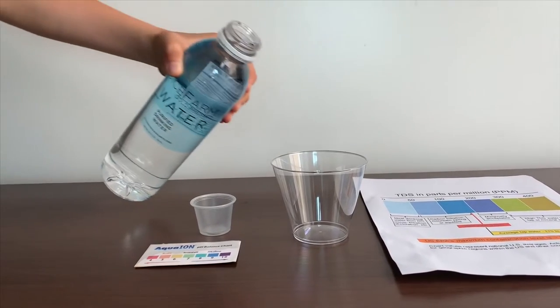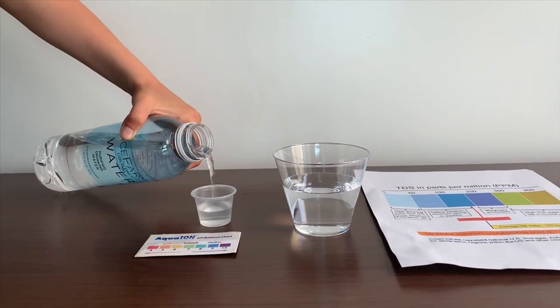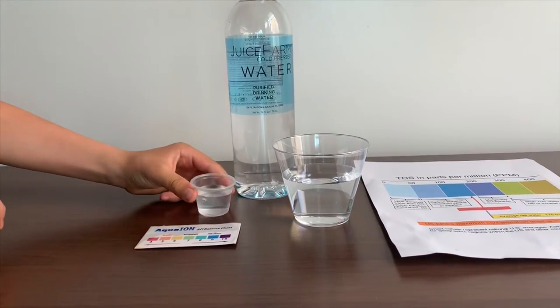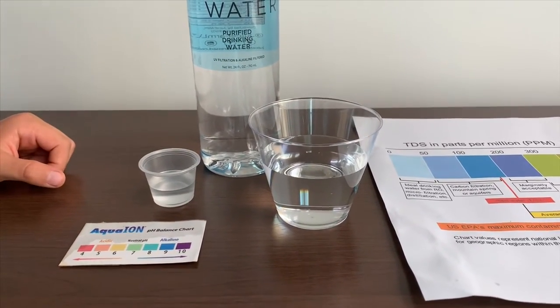Let's pour some water in. This is a little too much for the pH cup. Let's pour some back in the TDS. First we are going to test the TDS level.